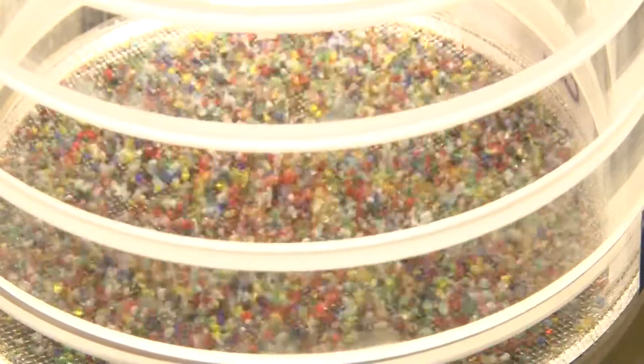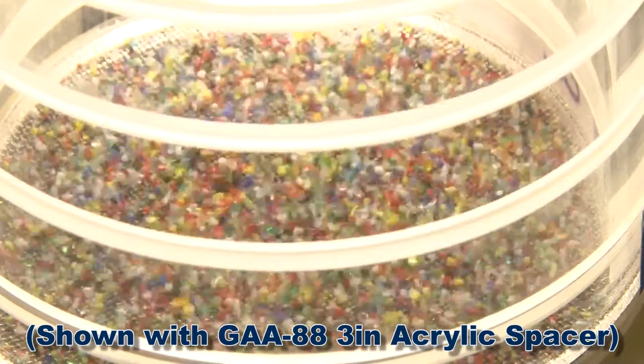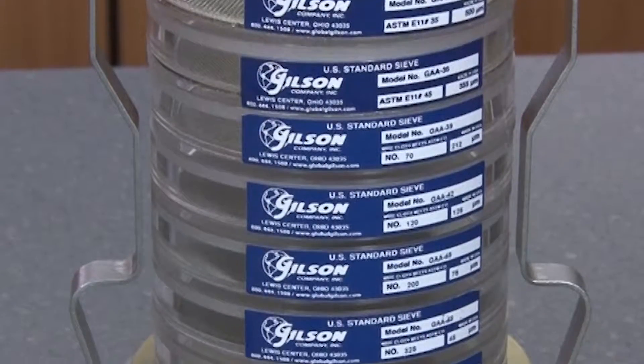These clear frames offer enhanced visibility to monitor separation performance of specimens during testing, and are precision machined for improved fit and reduced sample loss.